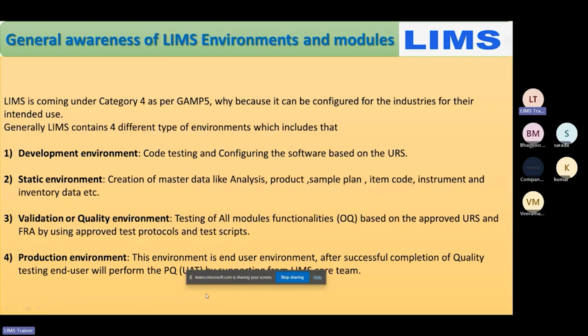After this, we develop the software using the user requirements, and testing and configuration. Then we go for a static environment. In this static environment, we prepare the master data like sampling plans, product information, analysis information, instrument and inventory data. All the data will be fed to that particular software. So this is a static environment.